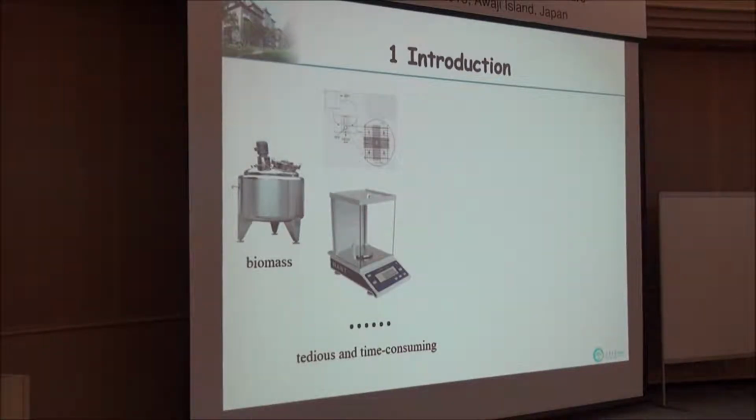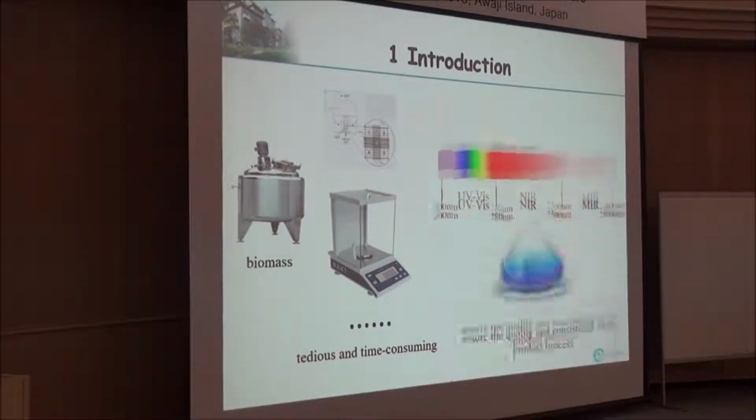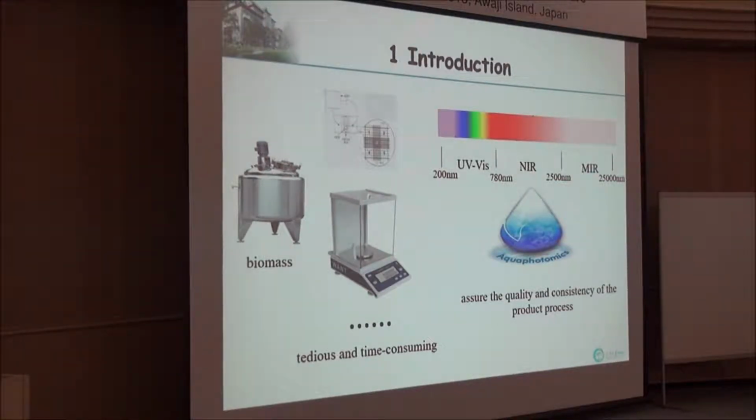However, traditional methods such as cell count technique and weighing are tedious and time-consuming. So, a new method is in great need to assure the quality of the production. NIR and Aquaphotomics were introduced in our study to prove its feasibility for biomass determination.